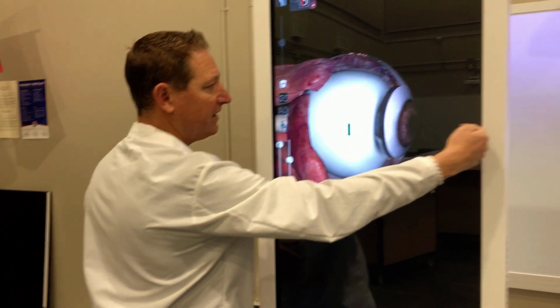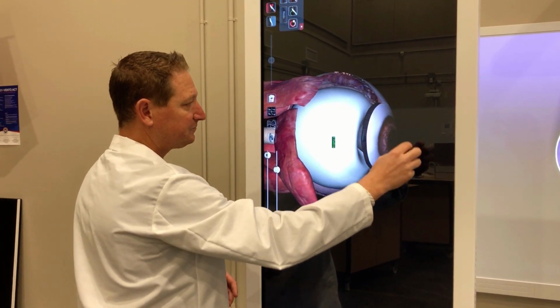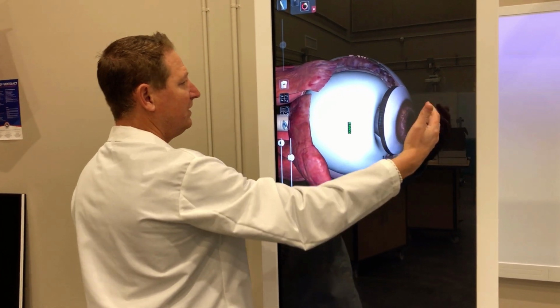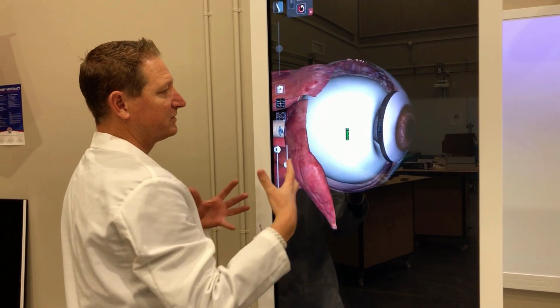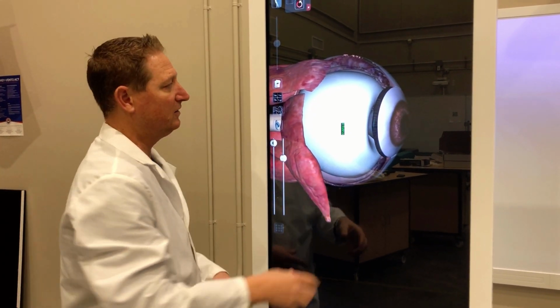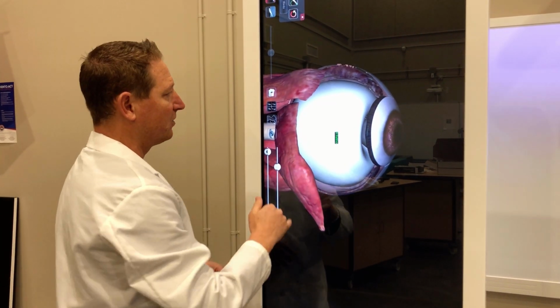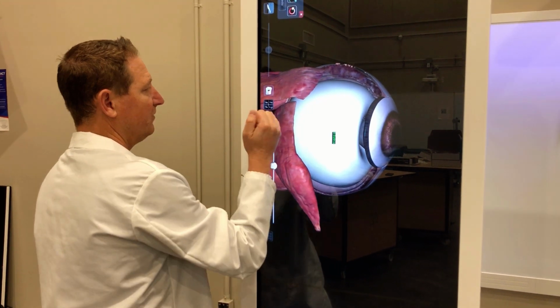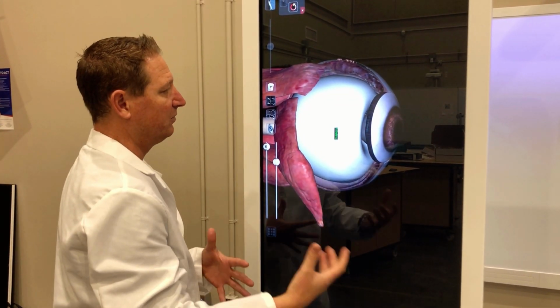So it's going to take all of that information as it comes through that cornea, through the aqueous humor, through the pupil, through that lens that's going to accommodate it, and it's going to come back and hit the back of this eyeball, and the back of the eyeball is going to take that with its rods and cones and create an image from the light. And so what we do need to know is if that lens is not accommodating correctly, then the image can be projected on it either too far back or too far forward, causing you to have issues and blurry vision.